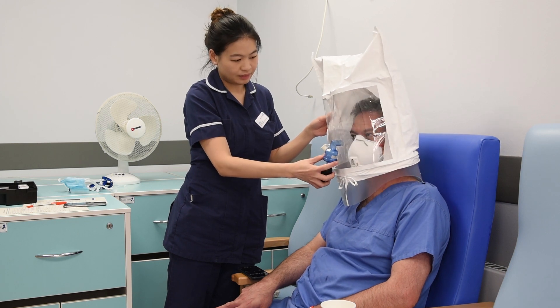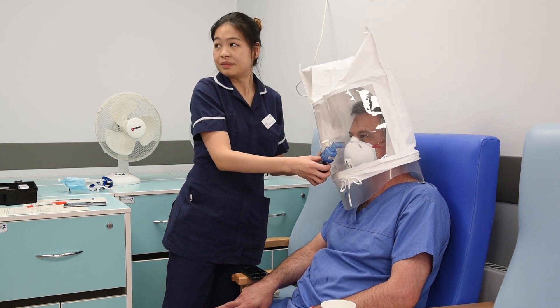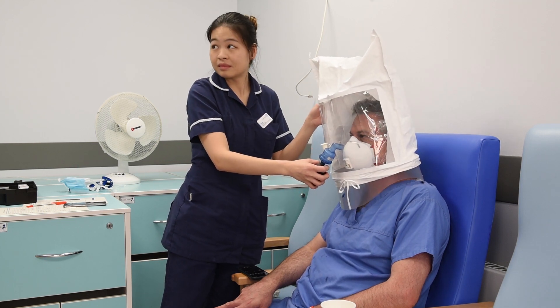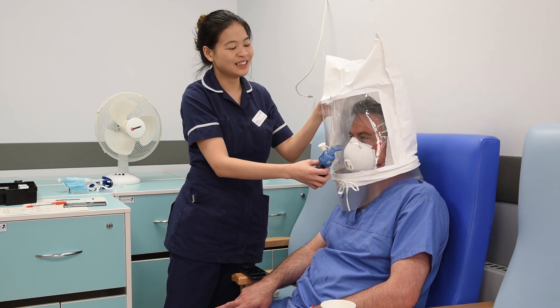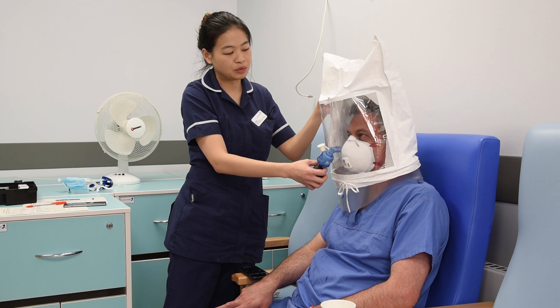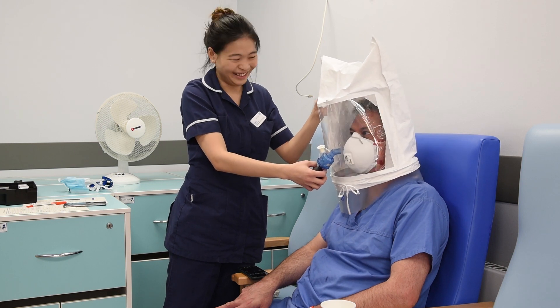It's very subjective, isn't it? It's not really objective. Well, when I did it with the tape on, I could taste absolutely nothing. And as soon as I took off the mask, I was gagging — it was so strong. Range of motion covers exposure to the neck and each side. I failed my first fit test on the 'yes' motion — I could easily say no, but when I said yes, I failed.